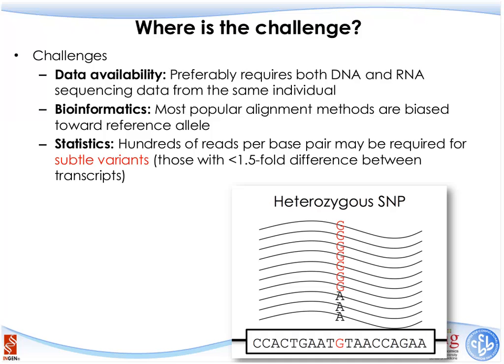So basically, your alternative allele is going to be 0%, 50%, or 100% of all the sequencing reads you observe. However, for RNA sequencing analysis, this is a very big deal because we are trying to quantify the differences between the expression levels of two alleles. And that subtle advantage offered by the alignment algorithm can really generate a lot of bias in our analysis.